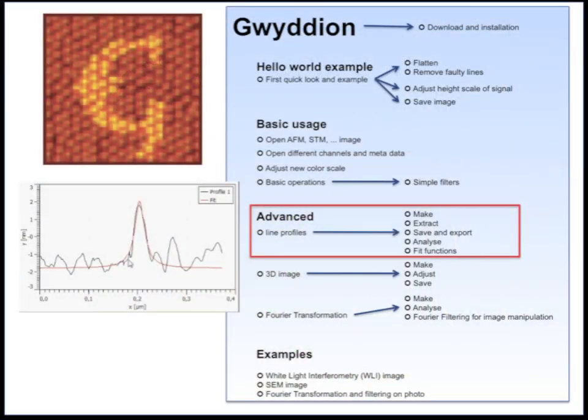In this video I will show you how to make a line profile through your data, how to extract it, how to save it and how to use it in another program such as Excel and how to fit functions to these line profiles such as a Lorentzian or a Gaussian.